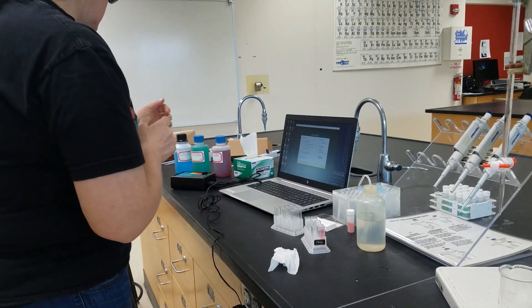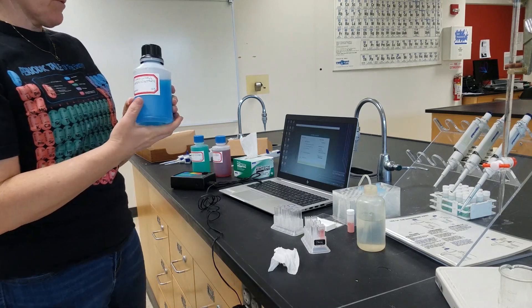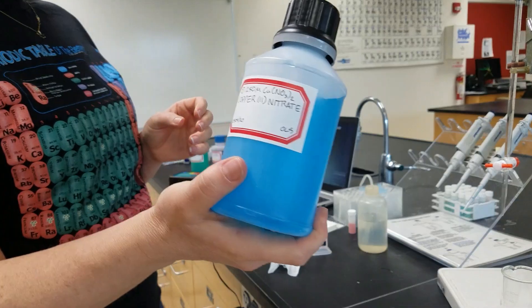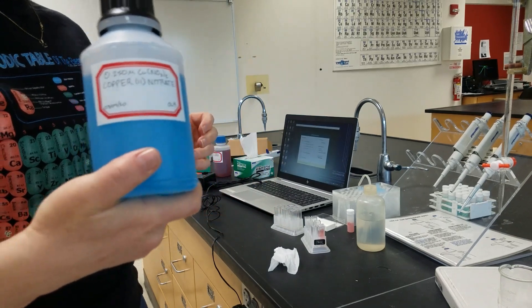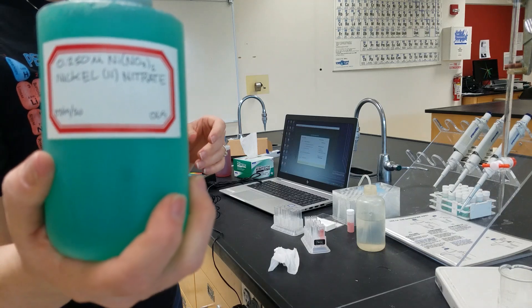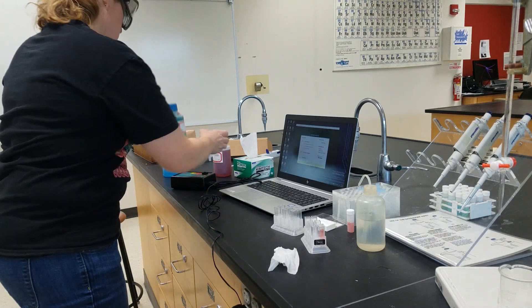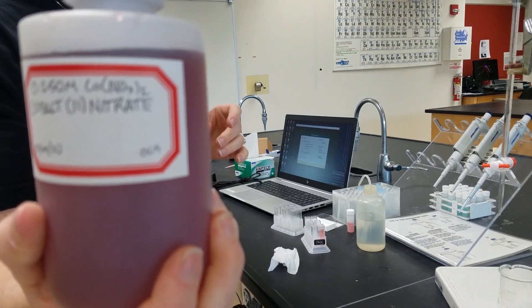We are also going to need known solutions that we can measure the absorbance of. So I have copper(II) nitrate, I have nickel(II) nitrate, and I have cobalt(II) nitrate.